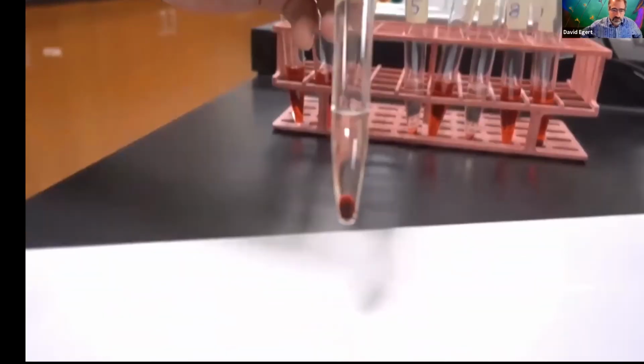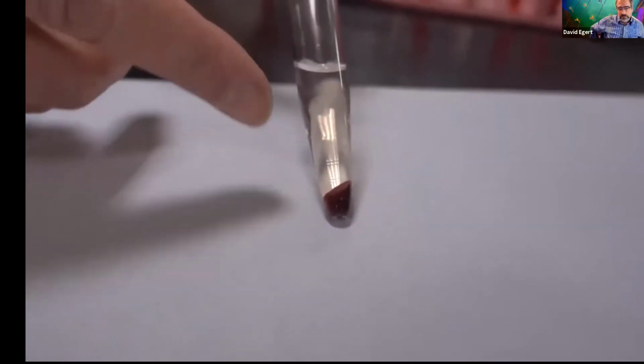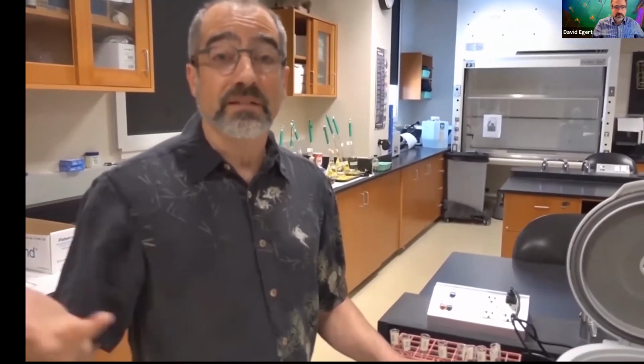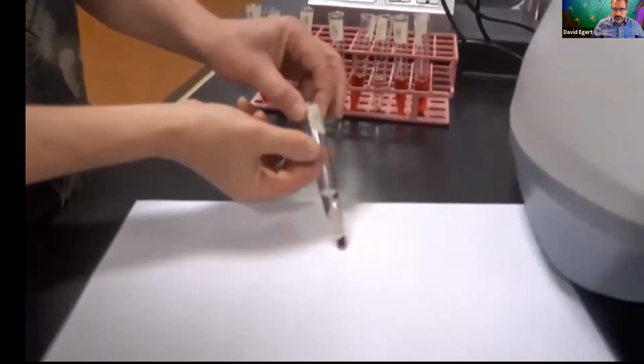We can see the one that is in the 0.3 osmolar solution. This is what we would hopefully expect the cells to be in an isoosmotic, isotonic solution. And we see in general, the cells all just got pulled to the bottom intact. There is a slight blush here, which you wouldn't really expect, except I think in this case, the cells have been sitting around for a while. Some cells might have died off just because they're getting old, not necessarily because the solution did it to them.